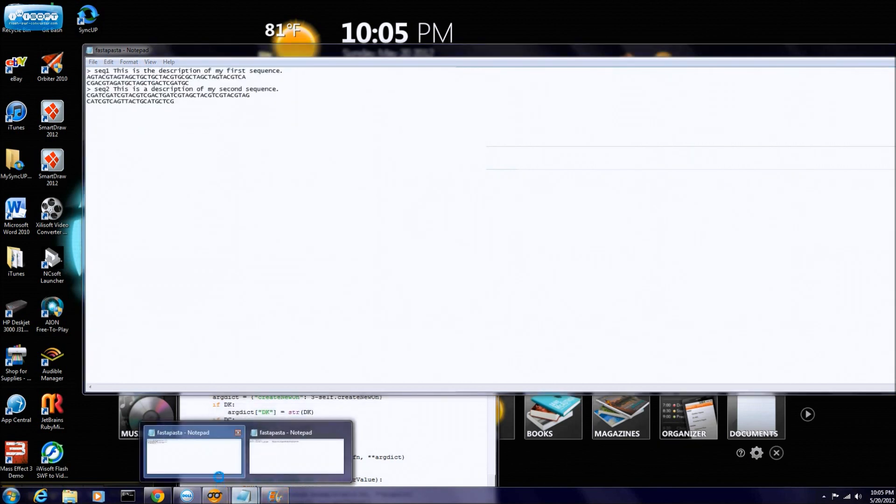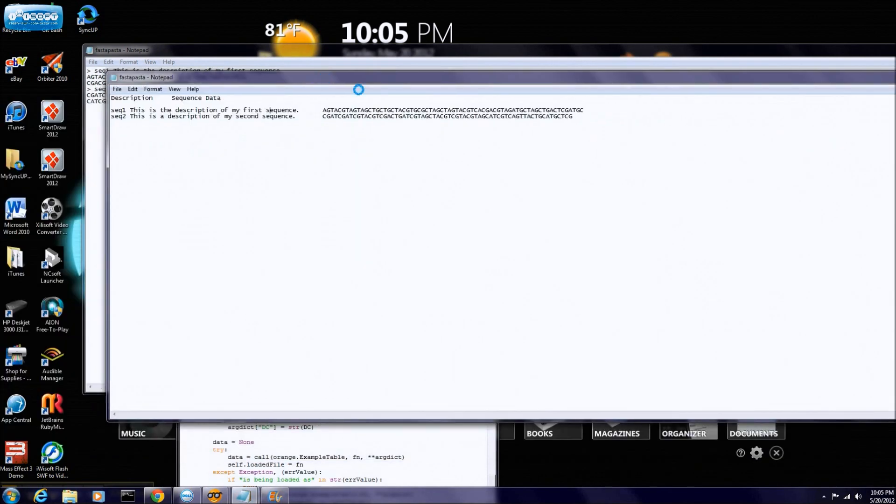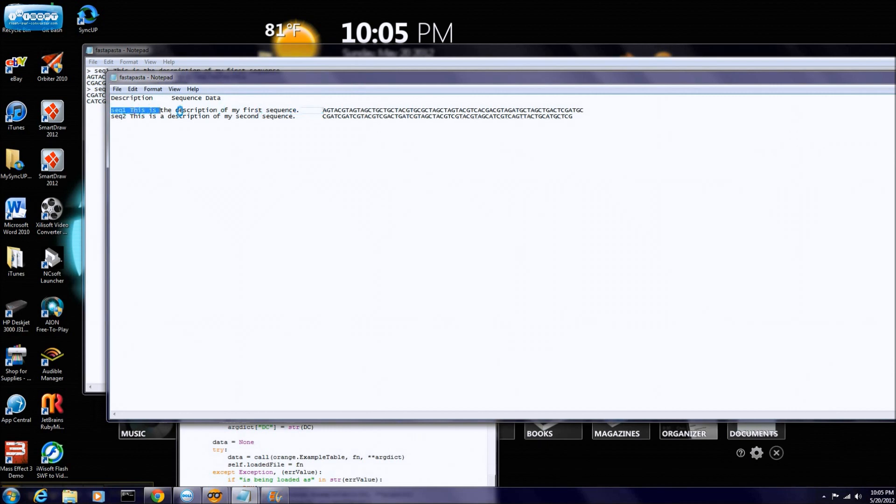And we're going to be changing this FASTA file into a tab file, which looks like this. And it's separated by a tab, a little separator right there. And this is our sequence, or it used to be our header, and that's what we got going on.